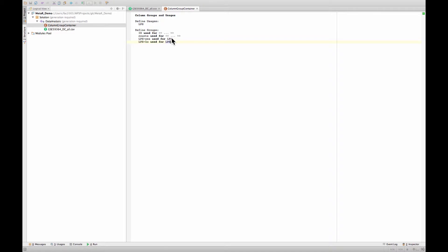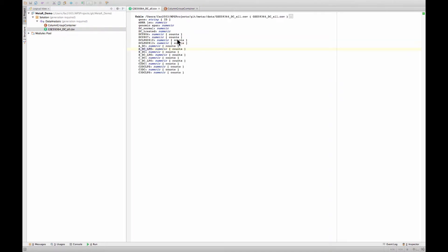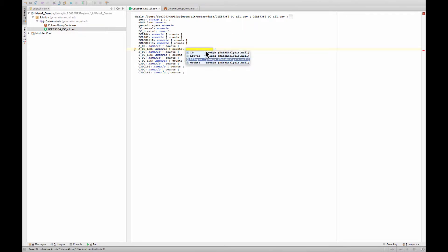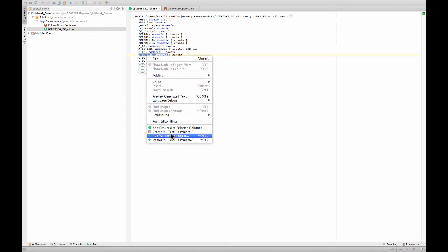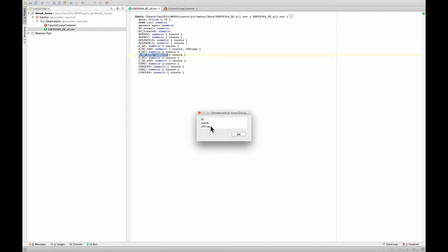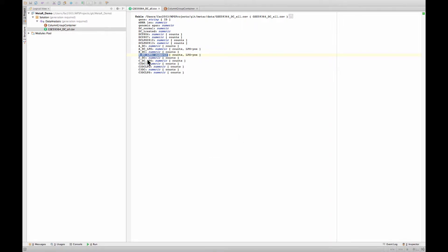And this allows us to do certain things. So for instance, here I can go back to the column and now annotate it as LPS yes. I can do the same here. So let's say that I want to select this one, and that's a group LPS yes. And you see that the group's list increases now.